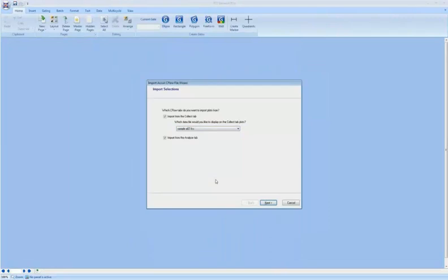It's now going to ask me the first question. There are only a couple of questions in this wizard, but they're important. Do you want to import the plots that you were looking at on the Collect tab or the Analyze tab, or both? If I leave the Collect tab checked, then I can choose any of the data files located inside the C6 file. But for this purpose, I'm going to uncheck that and just import what was in the Analyze tab.